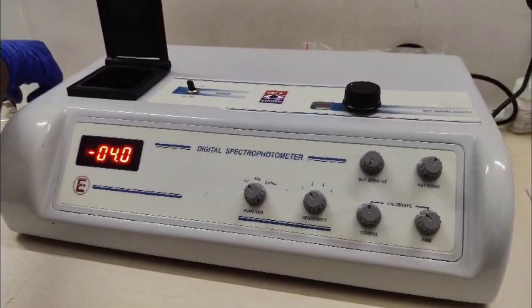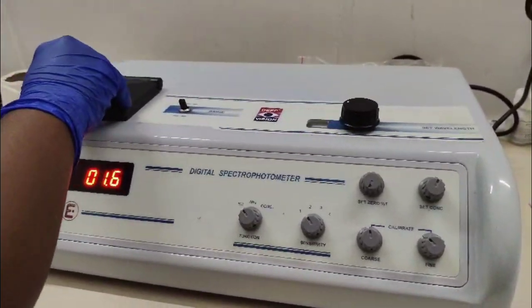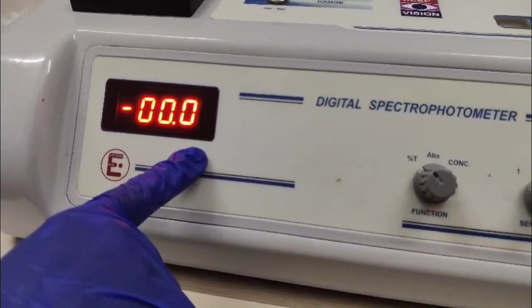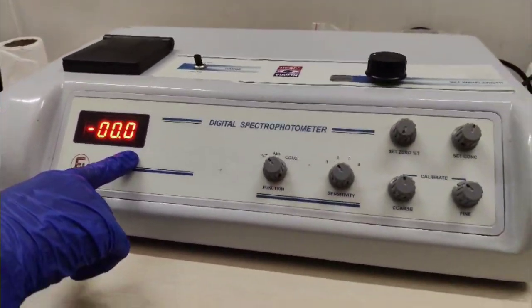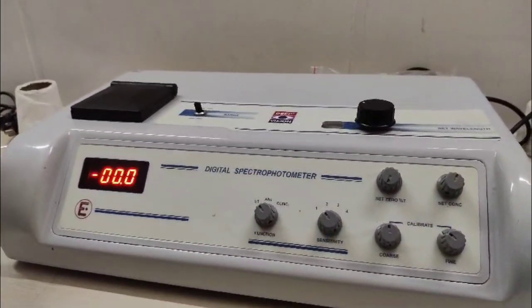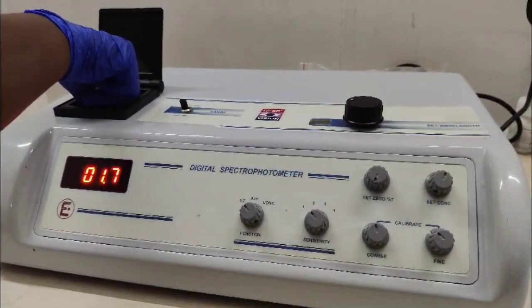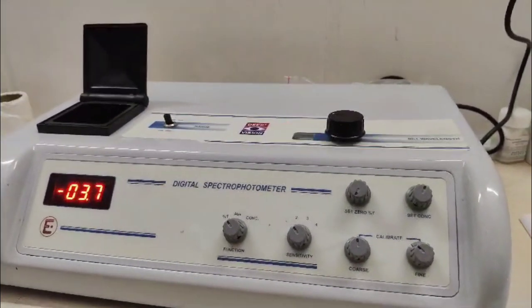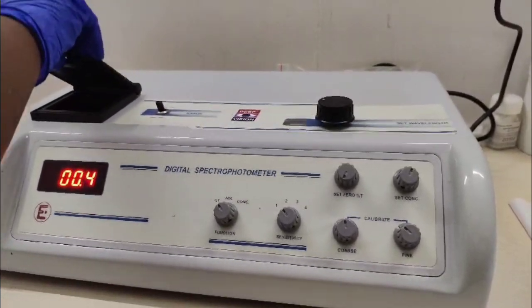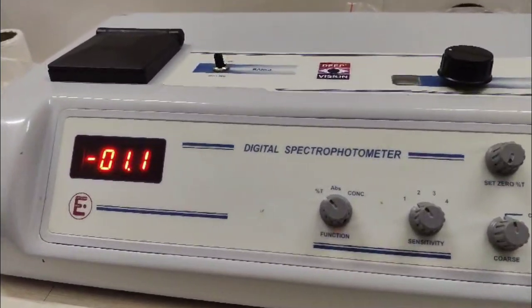Again, set the blank 00. Next, fill the cuvette with S4 solution. Value is 1.1.